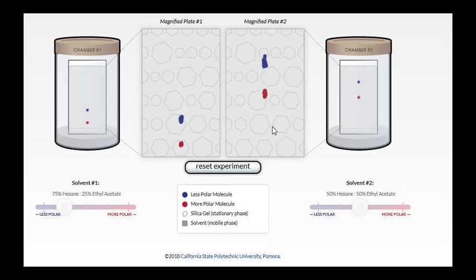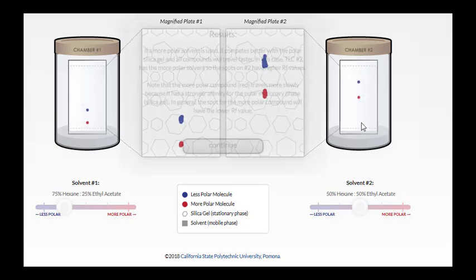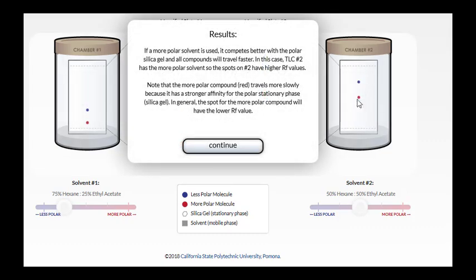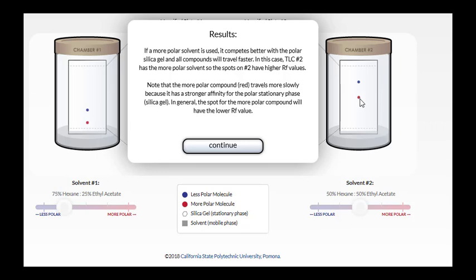And so if we were to analyze this mixture, we would say that the mixture has at least two components. It may have even more than two components because sometimes compounds will co-spot, and they'll end up appearing as a single spot even if there's more than one thing in that mixture. But we know that this is not a pure sample because it has at least two components.